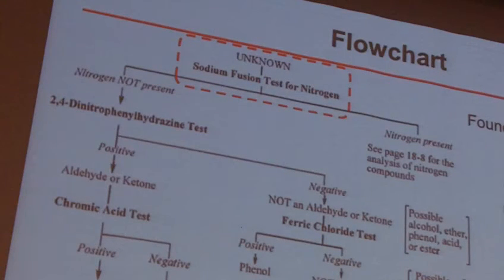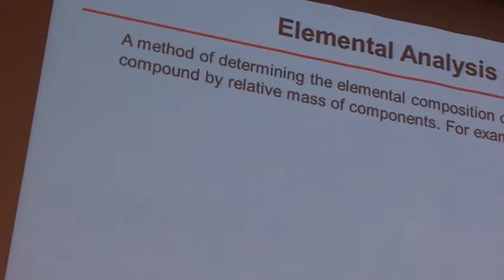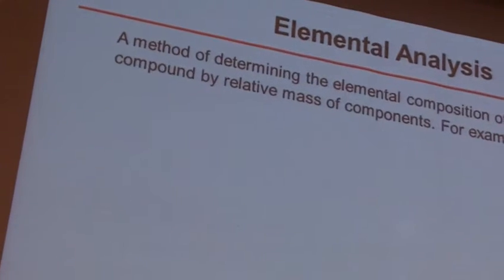So we're not doing the sodium fusion test for nitrogen, but of course, we still have to figure out, does this compound have nitrogen or not? How we're going to do that this year instead is you're going to get some information about the elemental analysis of your compound.